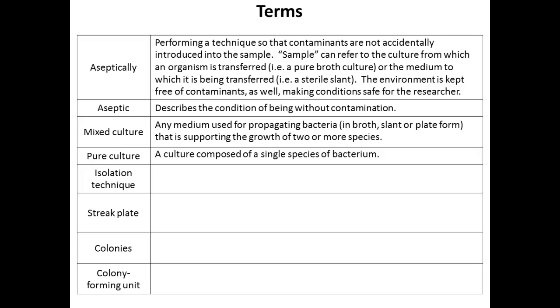The rest of the cultures, each has 1 name on it, right? So unless it's been contaminated, it should be that single organism in those tubes or on that plate. There are different isolation techniques, but the whole point is if you have a mixed culture of more than 1 organism, you want to separate them out so that you have individual organisms.